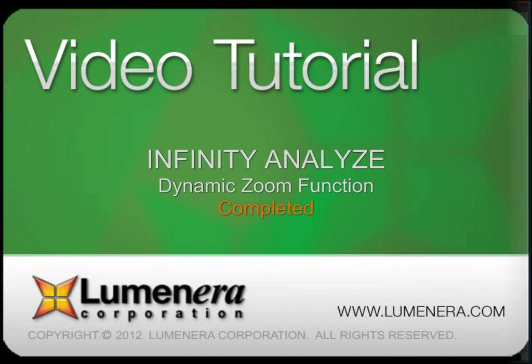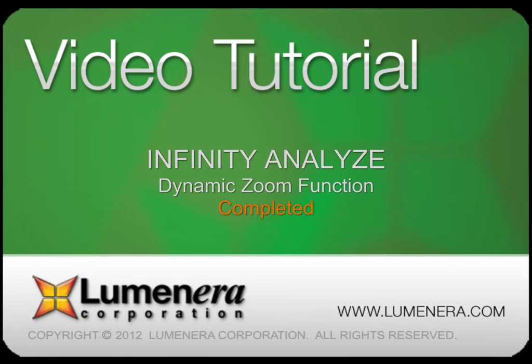And that concludes our video tutorial on the new zoom function. Be sure to check out the other video tutorials in the series.